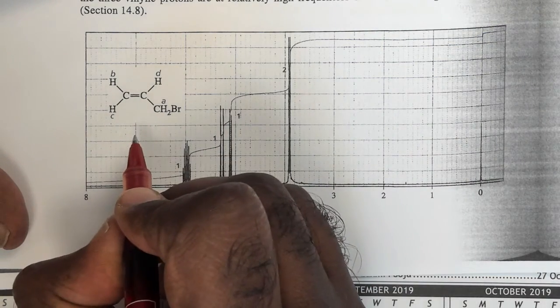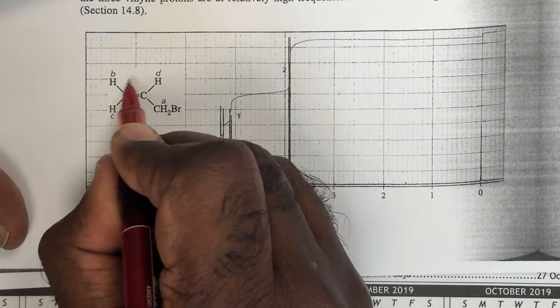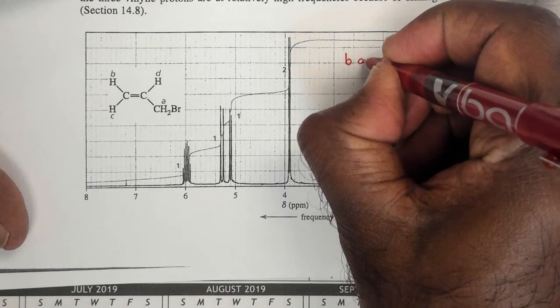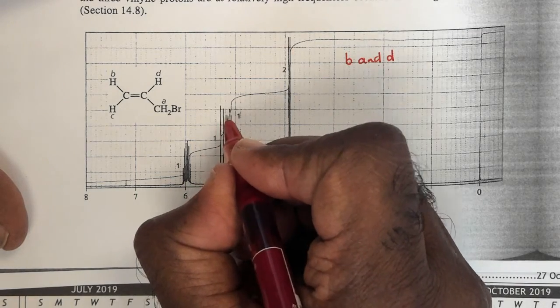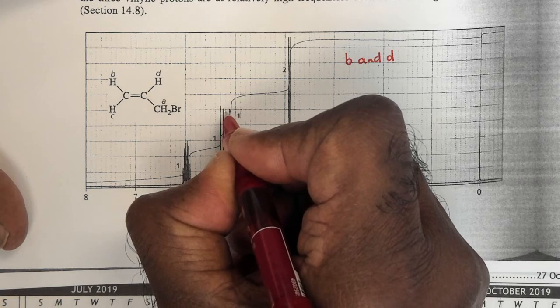We give it certain names, and we see that the protons that are cis to each other on the same side of the double bond, these two protons B and D, would have a coupling constant, and the coupling constant is just the distance between the two peaks in Hertz.